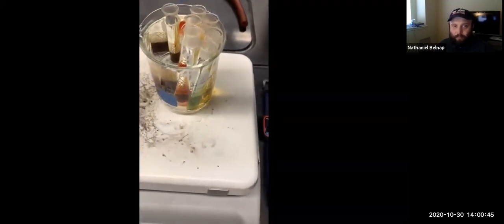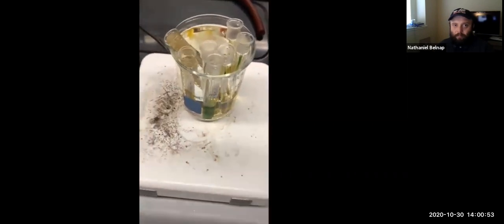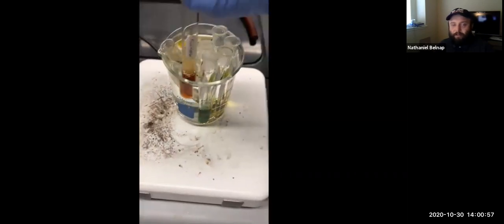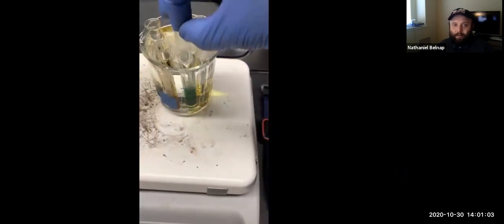So some are yellow, some are dark orange. Oh, it's turning like, oh. You should have some clamps or something to pick those up, but not with your hands. My inner safety supervisor makes me want to scream out of this video right now. Right, yeah.